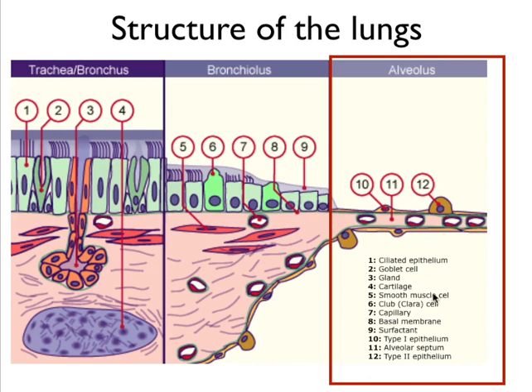So then on to the thinnest part of the lungs, the alveoli, with very thin walls. You can see here that the wall is very thin, and there are lots of vessels inside this wall for the blood to pass by. And these very thin walls are covered with very thin epithelial cells. And these very thin epithelial cells are called type 1 epithelial cells. So every once in a while there's also a bigger blobbed cell, which is called a type 2 epithelial cell.